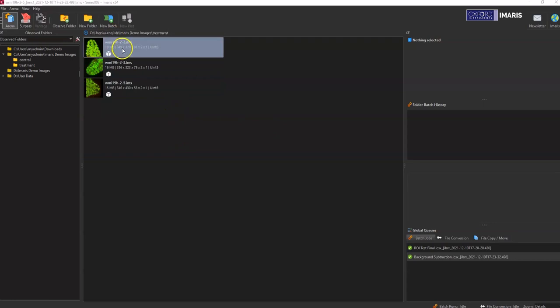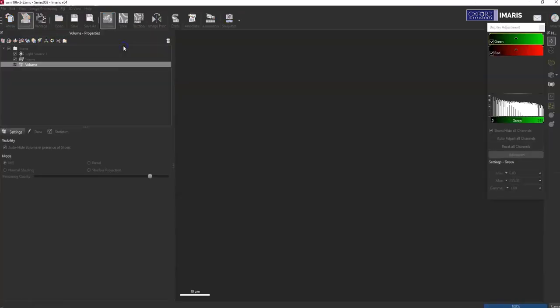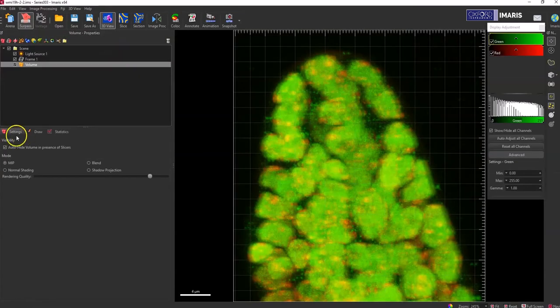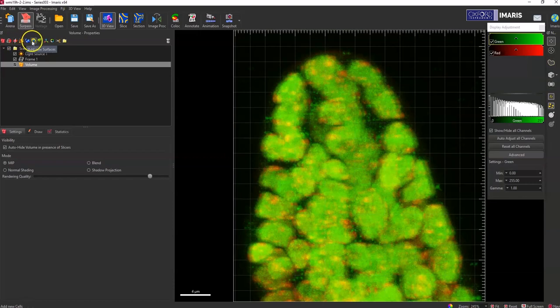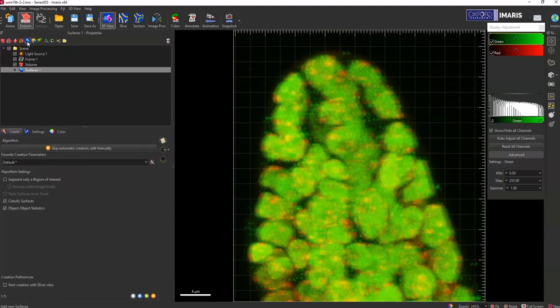So first you would just start off by opening up your image without doing anything with batch, and then you will select whatever object creation tool you want to use. For this example I'm just going to use surfaces.